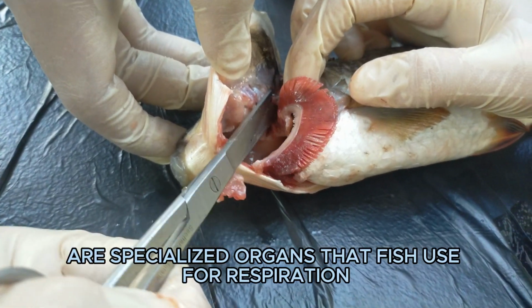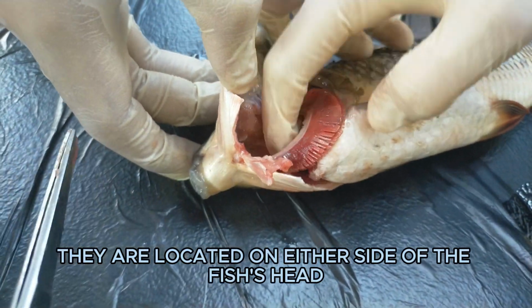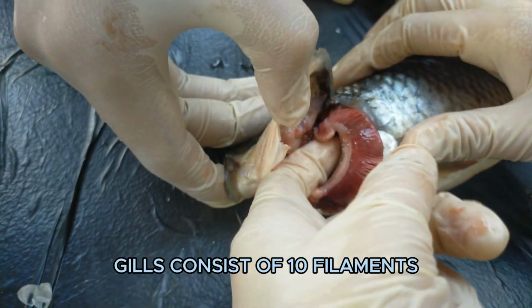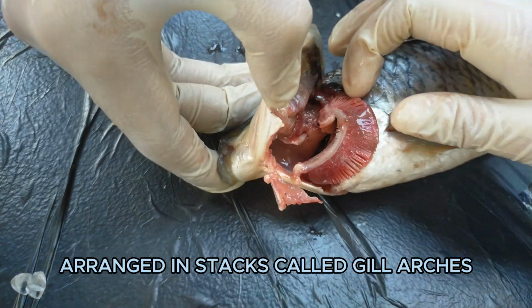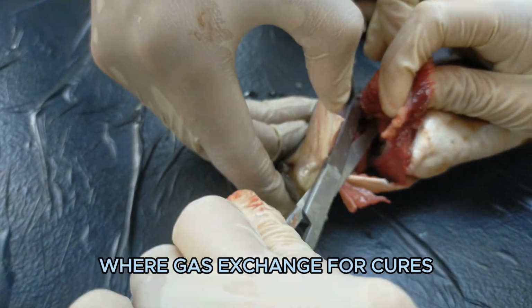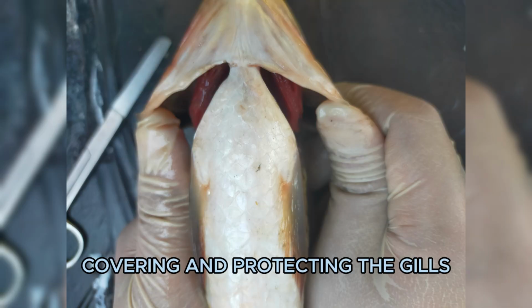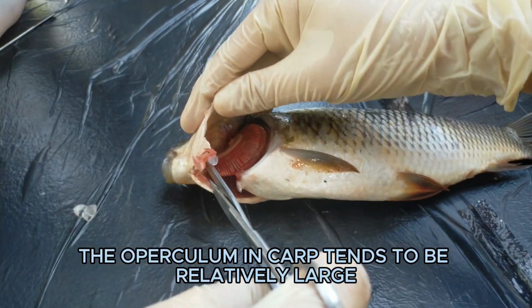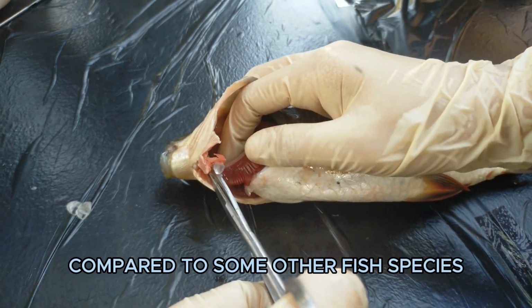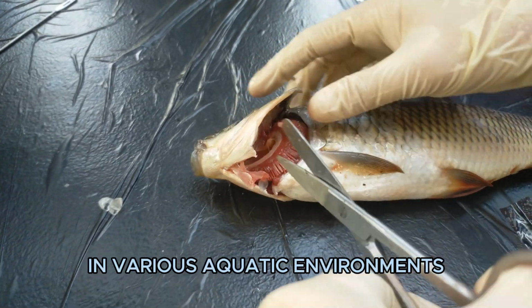Gills are specialized organs that fish use for respiration. They are located on either side of the fish's head behind the operculum. Gills consist of thin filaments arranged in stacks called gill arches, and each filament contains numerous small blood vessels where gas exchange occurs. The operculum refers to a bony flap covering and protecting the gills. The operculum in carp tends to be relatively large compared to some other fish species, reflecting their need for efficient respiration in various aquatic environments.